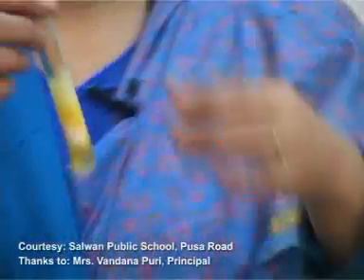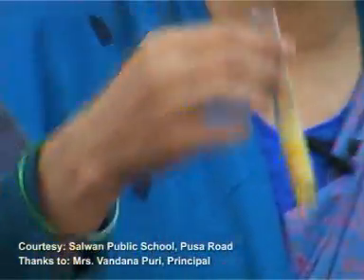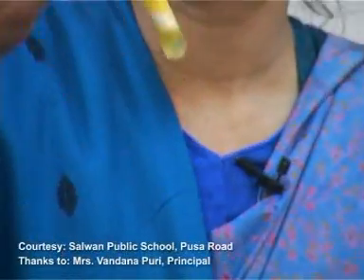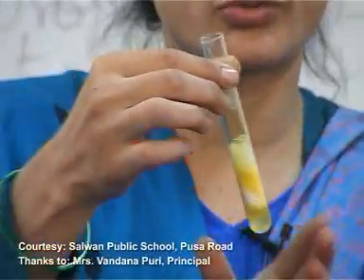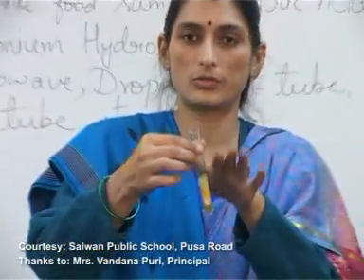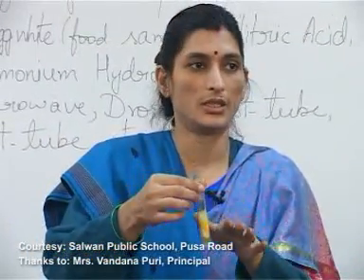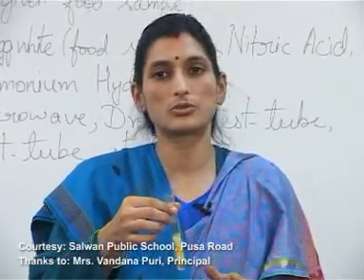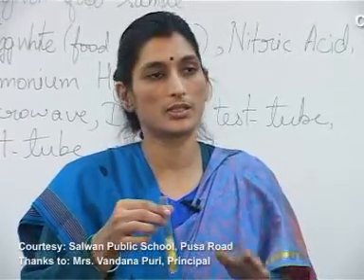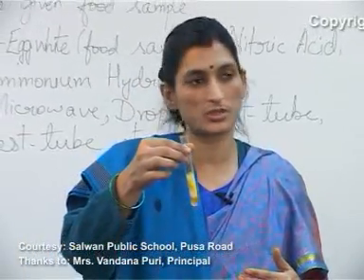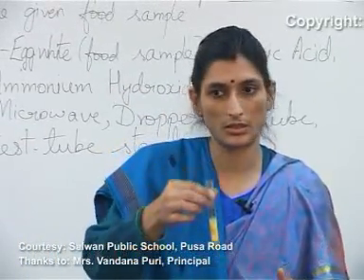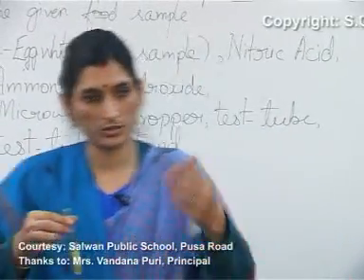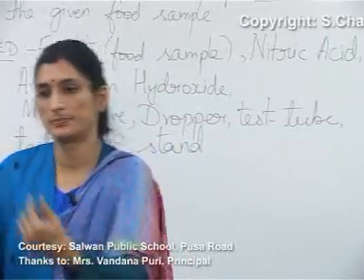Now we have to rinse this — that means we have to remove all the liquid and rinse it to remove the extra nitric acid present in it.